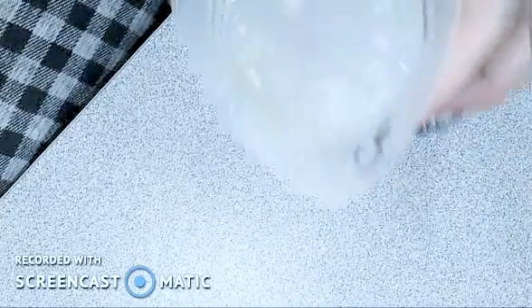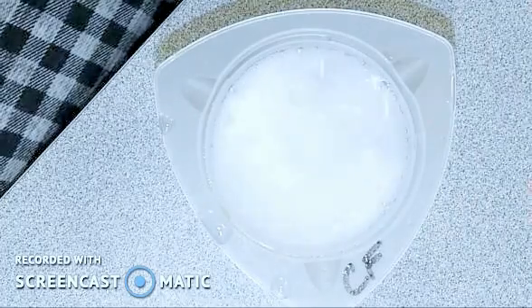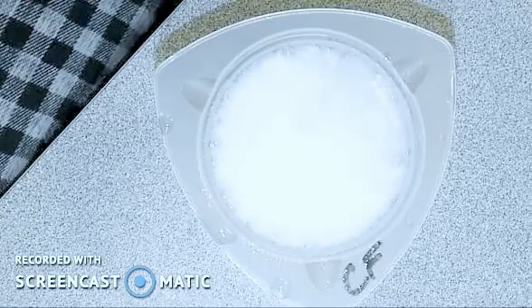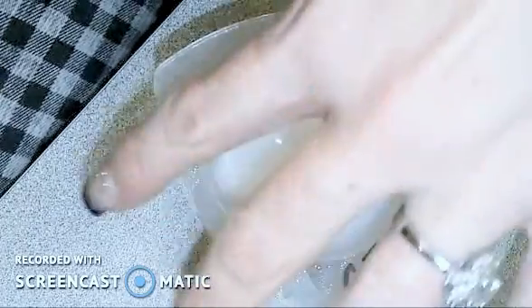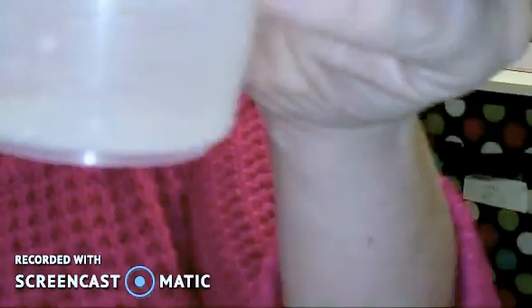Notice how much more just furious it effervesces. That's definitely an observation to make, guys. So we make all these quantitative observations. How much time does it take to dissolve? Yes. But qualitative observations are different things that you cannot put in terms of numbers. Oh, you can't see that, but I can see it. I feel like I'm such a bad camera person.